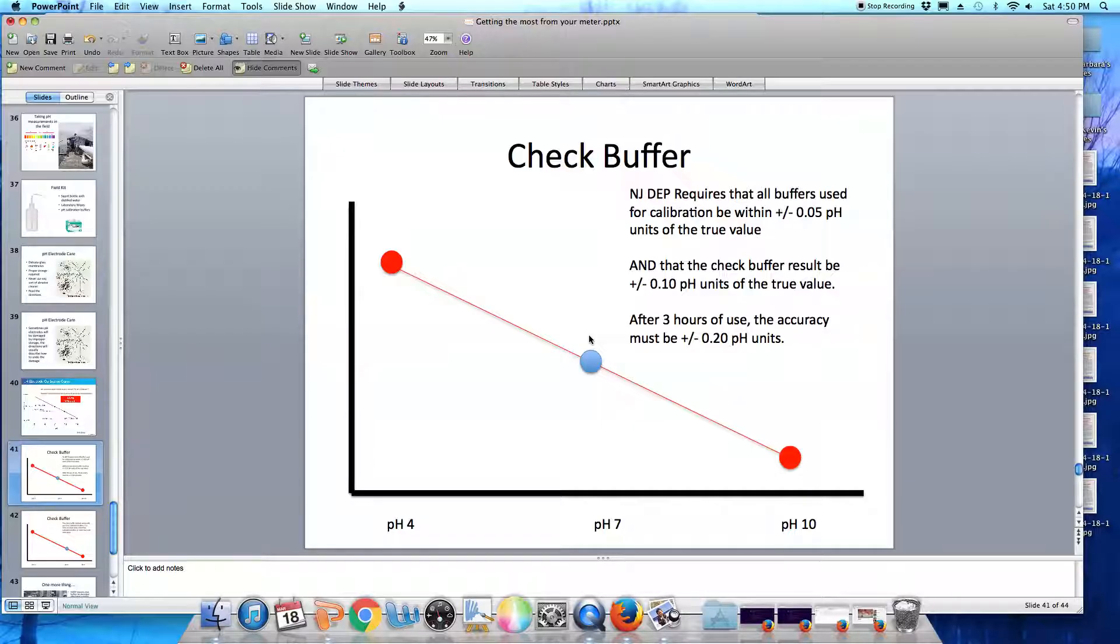We could also use pH 6 or pH 8 as our check buffer as long as the check buffer has a pH value between the two buffers that we use for calibration.